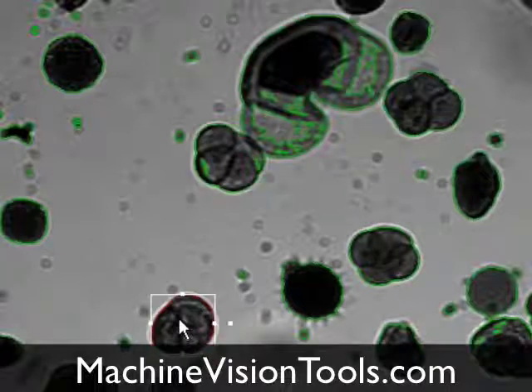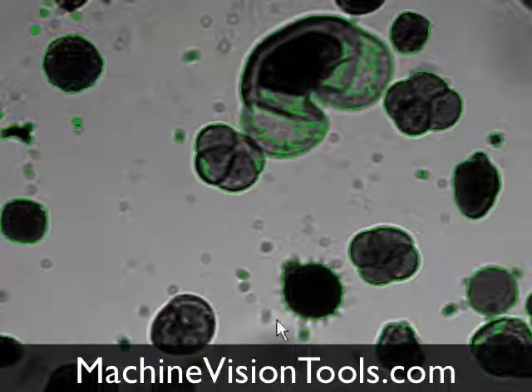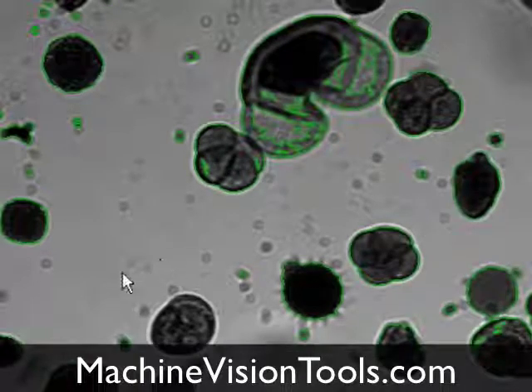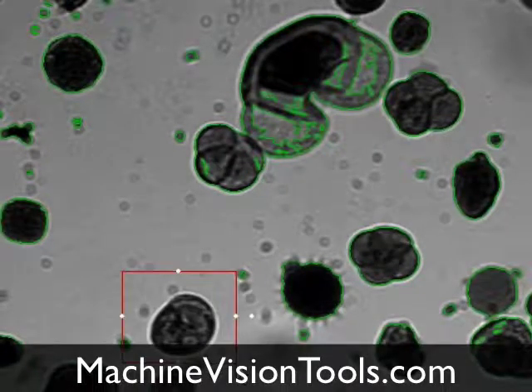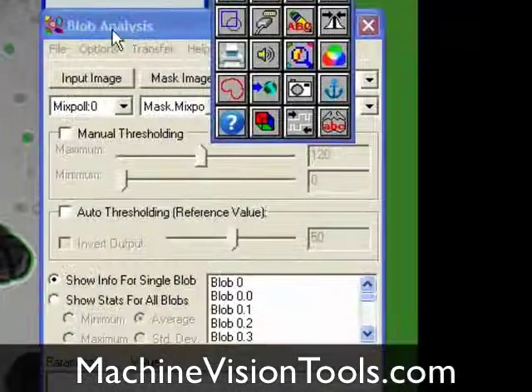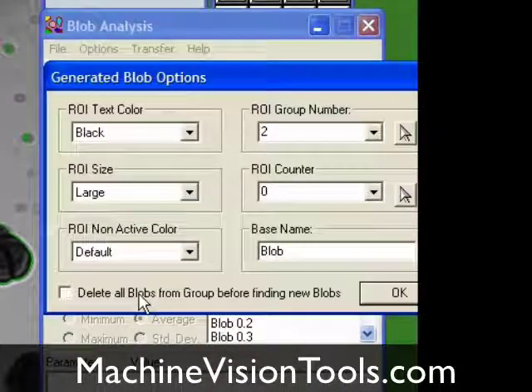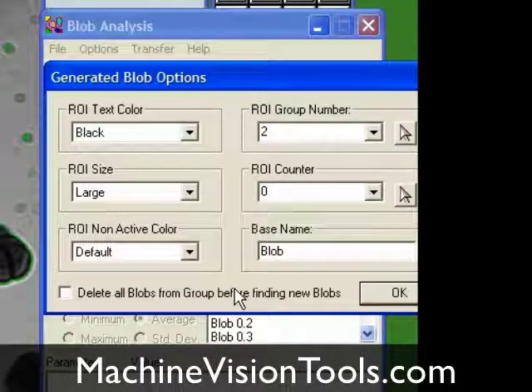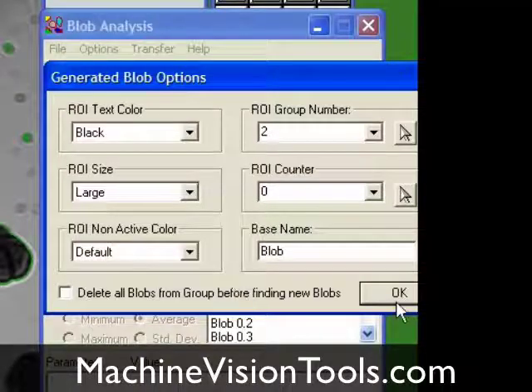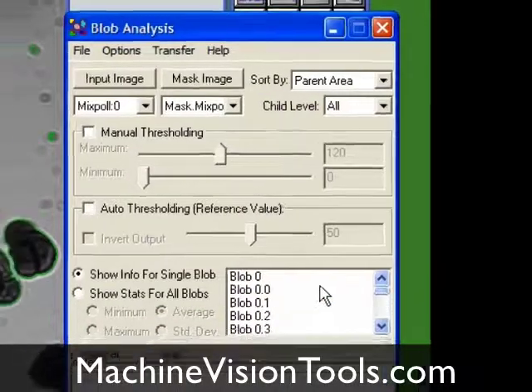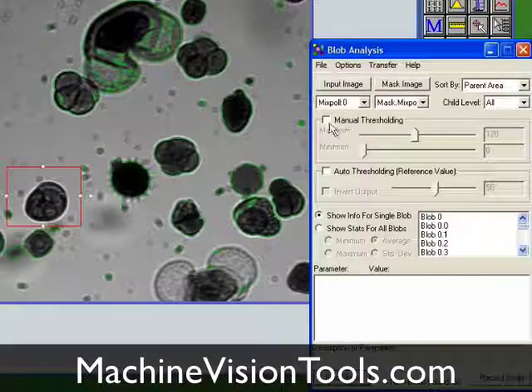To do that, we'll delete this blob, draw a rectangular ROI around it, and then in our blob creation options dialog, deselect 'delete all blobs from group before finding new blobs.' That way we can find blobs inside that rectangular ROI without losing the rest of the blobs in the image.